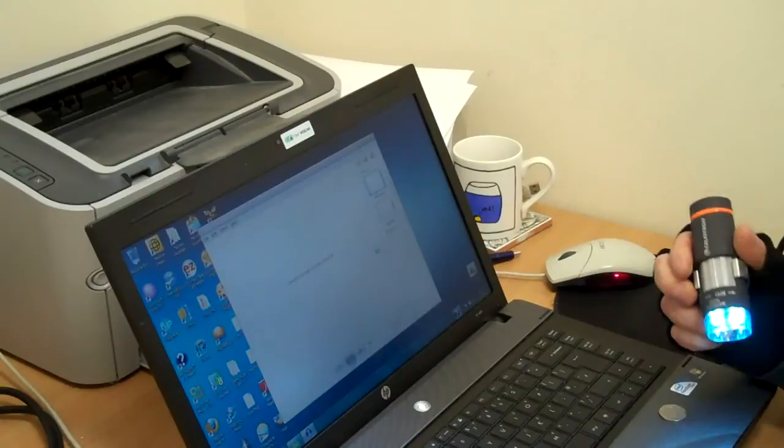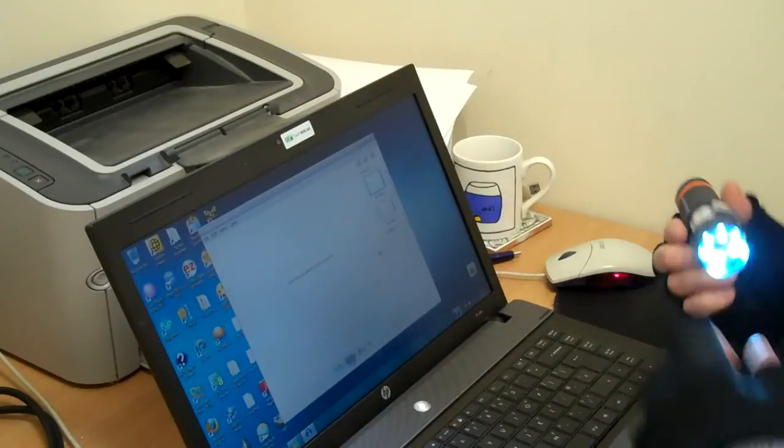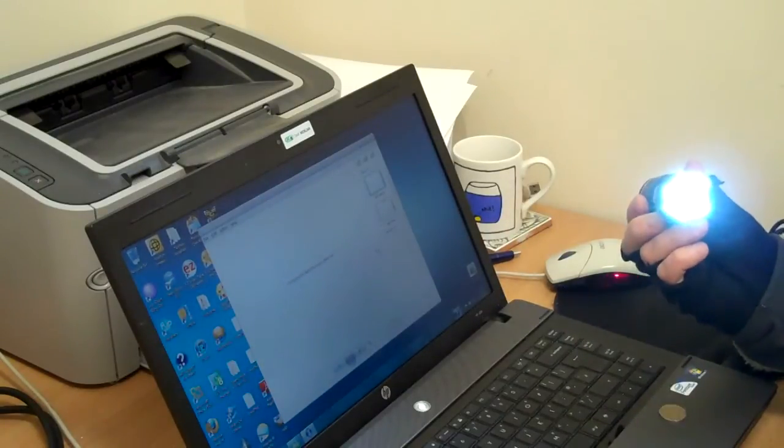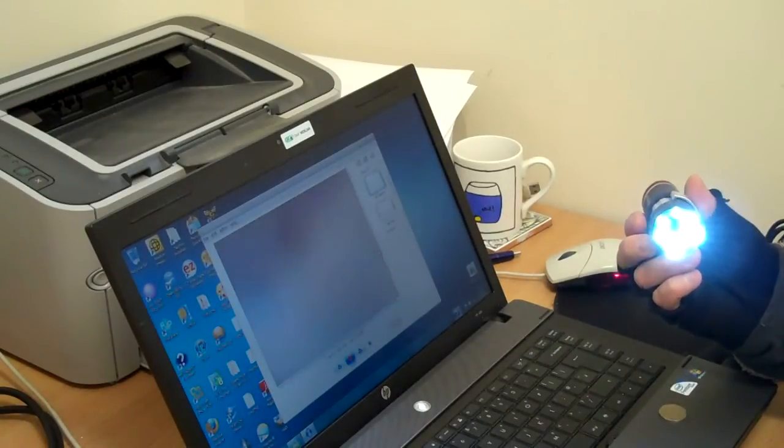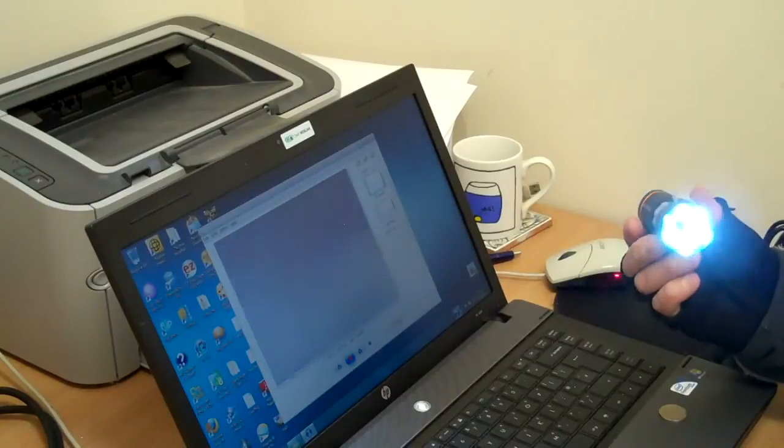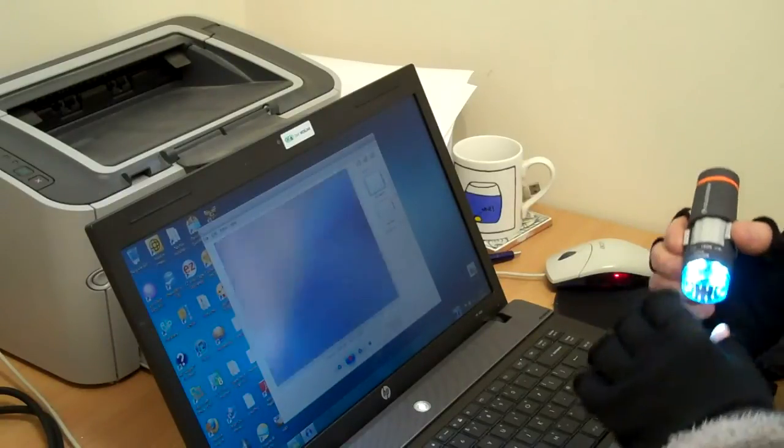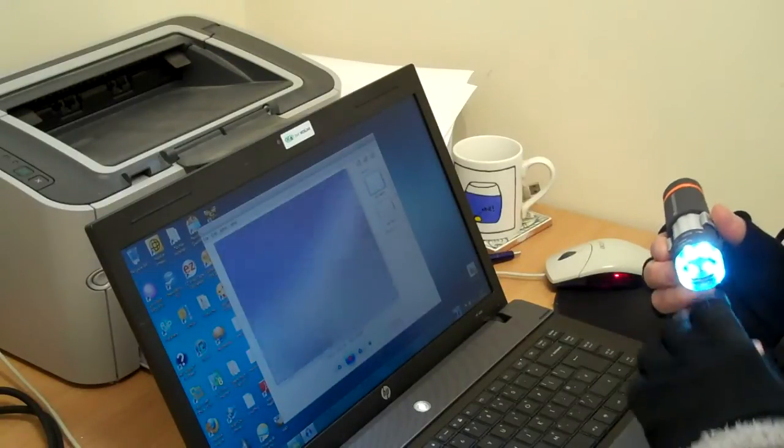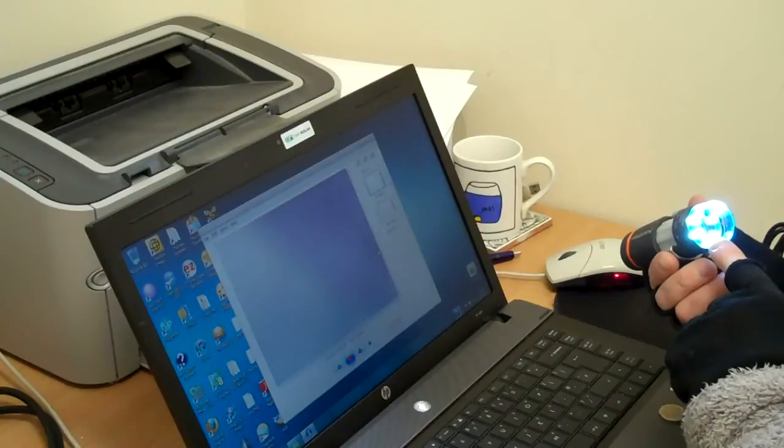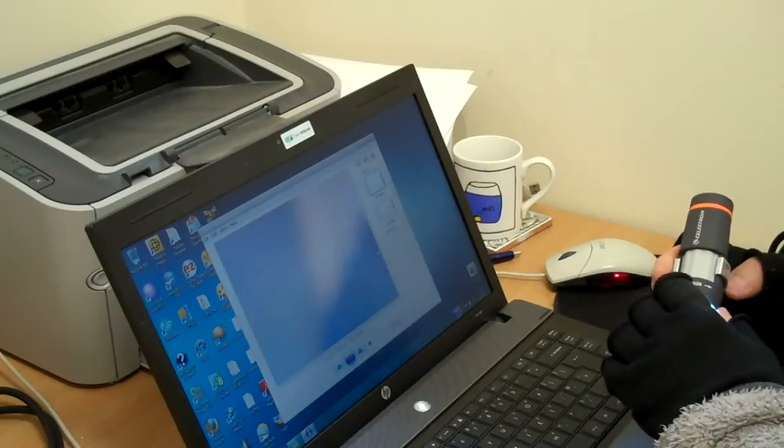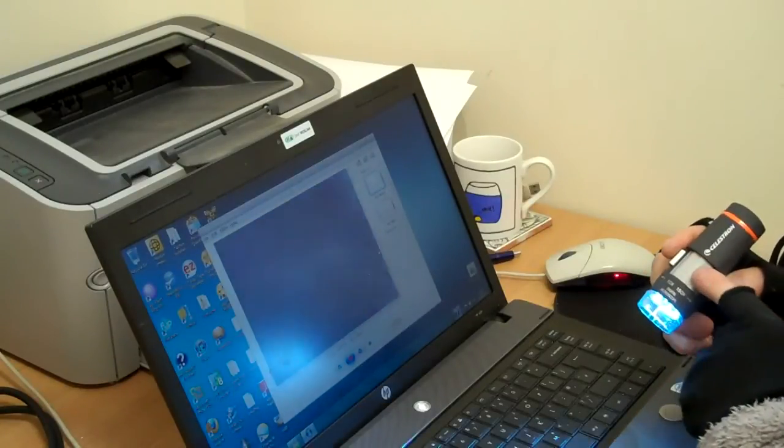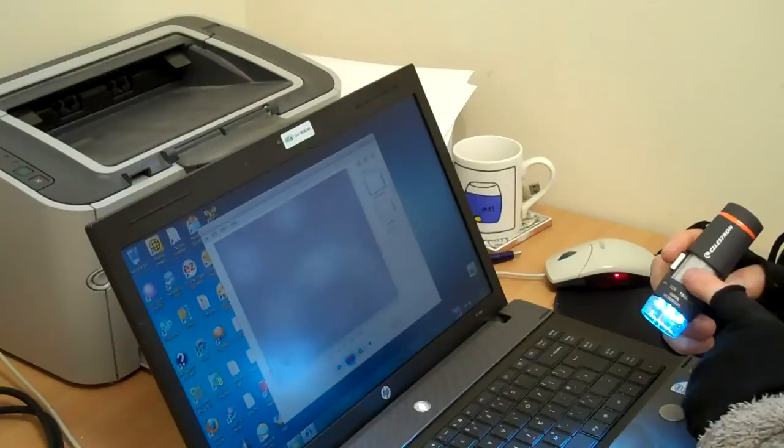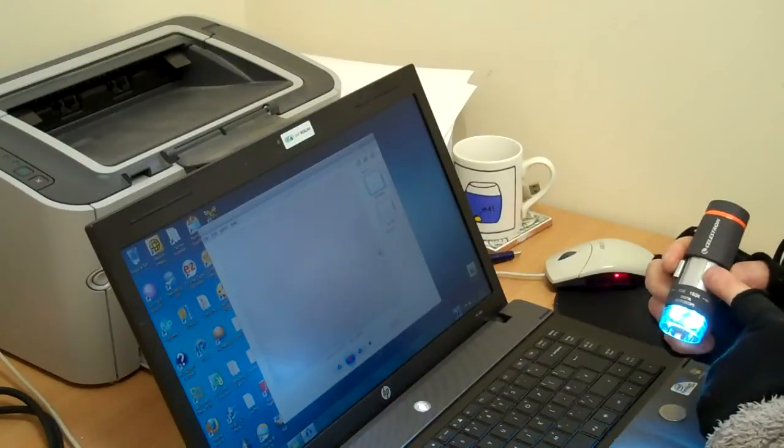So I've installed the software. You plug in the microscope and lights come on. There's 6 LEDs there to illuminate whatever you're looking at. And you focus with this grey wheel here.